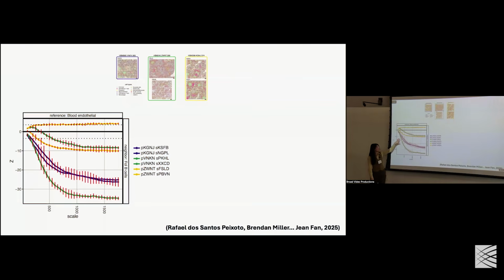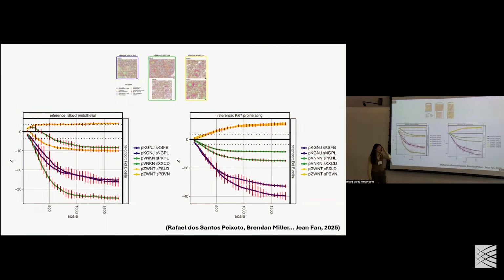So we see sometimes it's co-localized, sometimes it's separate, sometimes it's more separate, but it's not necessarily coherent within a particular patient, which we have two tissue sections per patient highlighted here with the same colors. And this is in contrast to other cell type relationships, which can actually be quite different across patients and quite consistent within patients. So this is Ki67 proliferating cells with respect to follicle B cells.